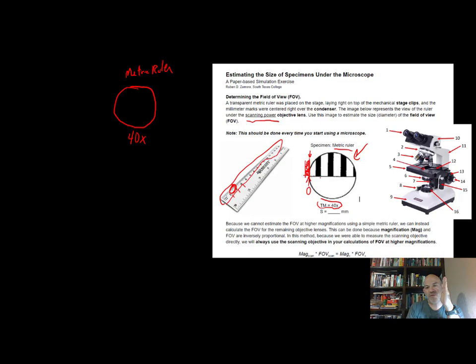And that means you have to go to the right side of the next one to get to another millimeter. So that's 1 millimeter. If you come to this side right here, that's not a millimeter because you haven't gone all the way to the right side yet. So that's not a millimeter. That's a millimeter. Then you have to go all the way to the next one to get to the next millimeter. So that's 2. This would be 3. And then it's not 4 because the 4th mark goes off of the field of view.